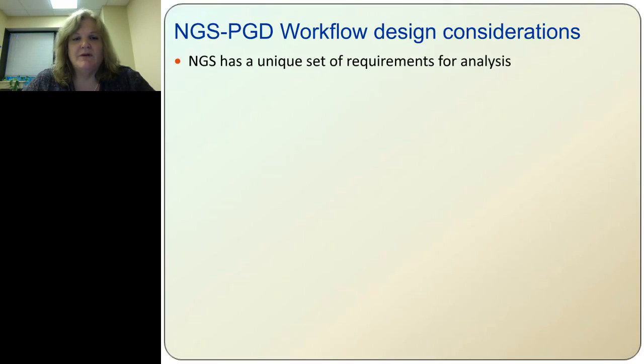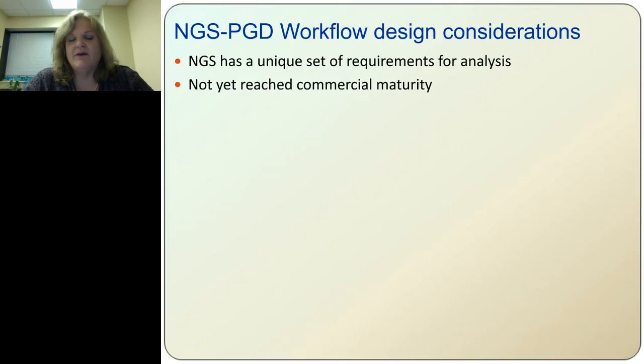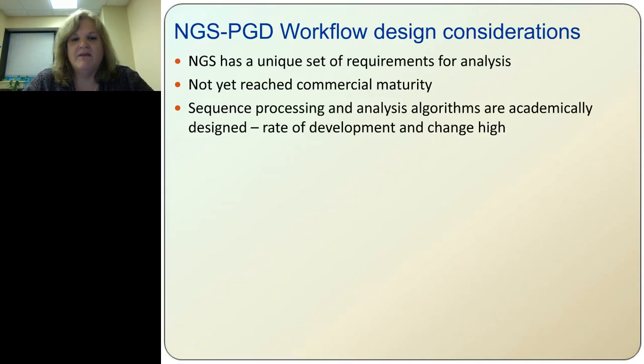So in the workflow design considerations for next-gen sequencing, it has a unique set of requirements for analysis. If you remember the earlier slide I showed with the workflow for NGS, each step could be a different piece of software that is often rapidly versioned. So NGS workflows have not quite reached commercial maturity since most of the software is publicly available.